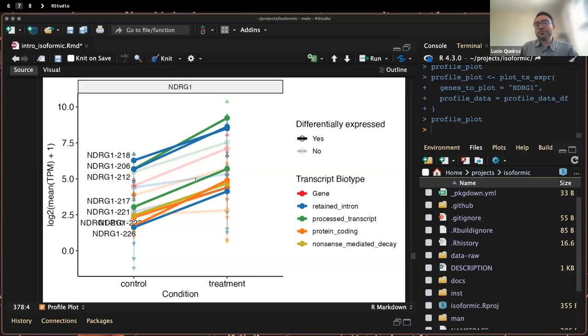But actually some protein coding genes were differentially expressed. And at the gene level, using the traditional cutoffs of 0.05 in the p-value and in the fold change, it would just not be identified as a differentially expressed gene. And we could have brought a more biological explanation, but that data set is available. Worked a lot on that.